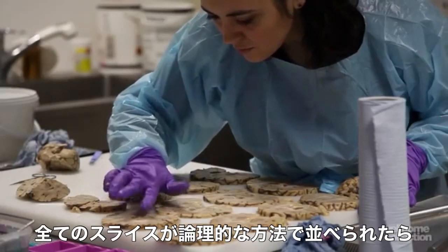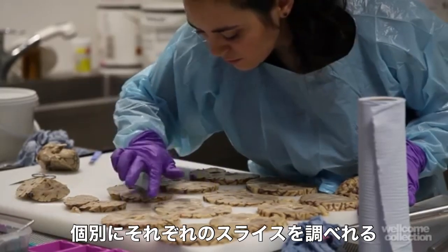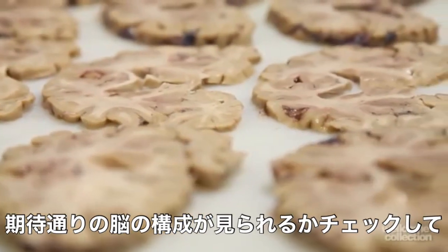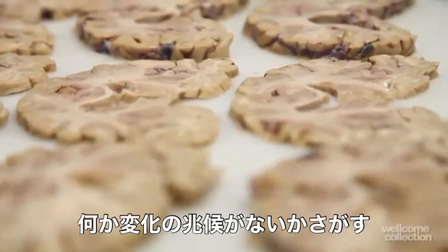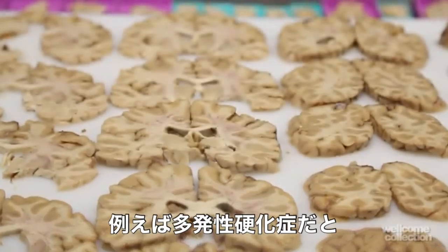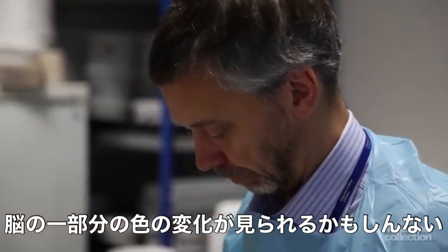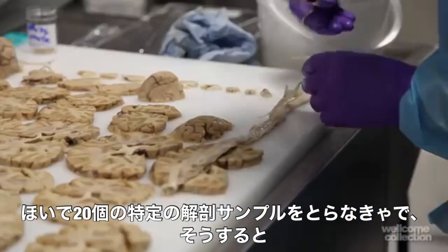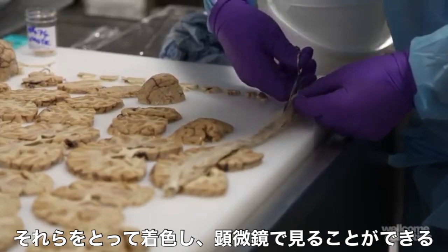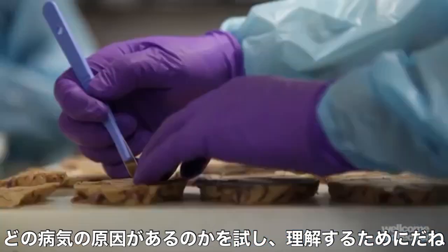When all these slices are laid out in a logical fashion, you can inspect each slice individually, working from the front to the back of the brain, just checking that all the structures are as you would expect them to be. Looking for any signs of change — whether it be in multiple sclerosis, for example, where there may be changes in the colour of parts of the brain. We then have to sample 20 specific anatomical areas to allow us to take them away to be stained and look at them down the microscope.